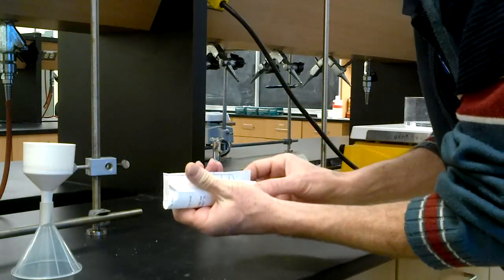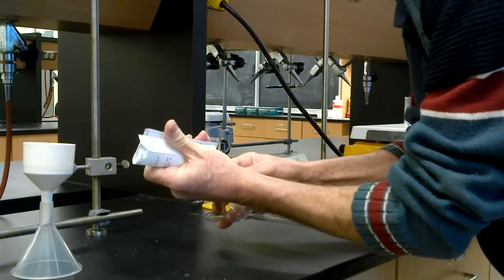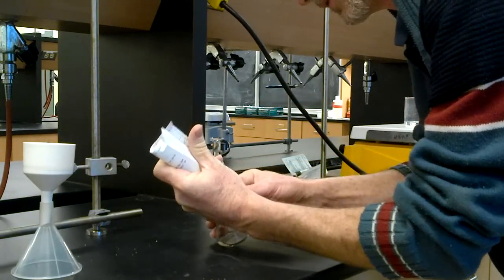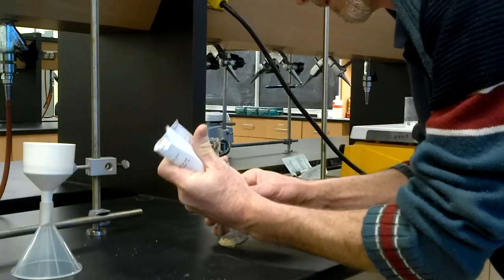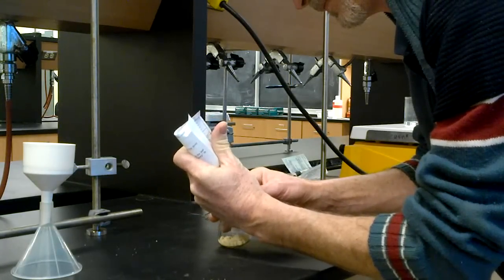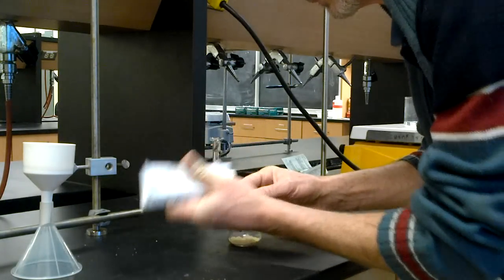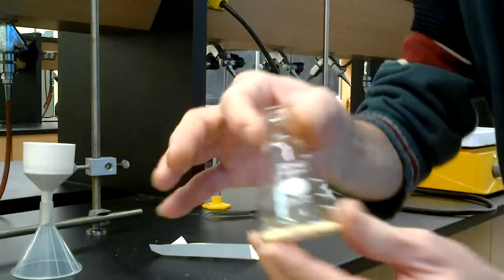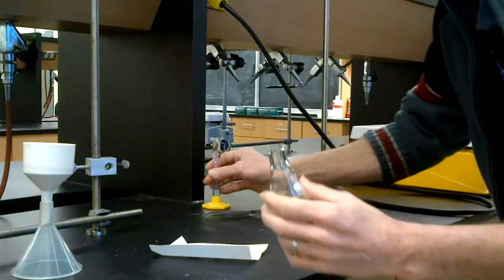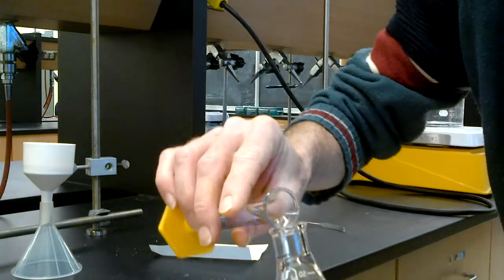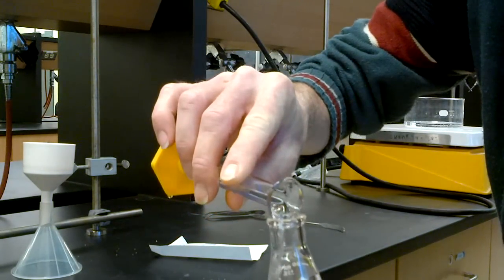And I can just make a nice tube here, slide it into the Erlenmeyer. There. 50 milliliter Erlenmeyer, and we'll start with 10 milliliters of methanol.